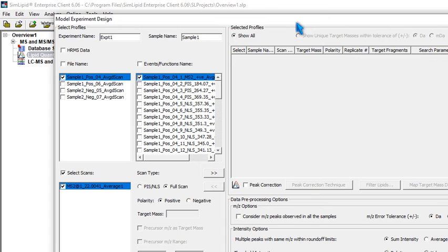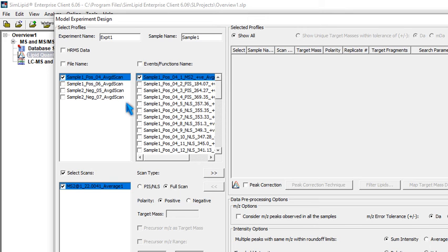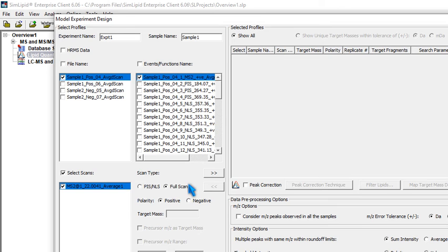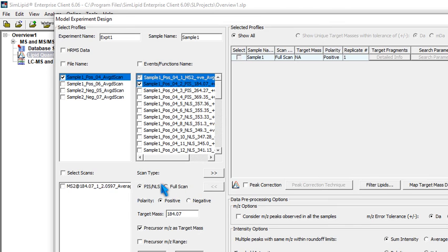Here you can design your own model experiments. One or more samples can be enlisted for the design. The scan information will be automatically visible upon selecting the scans. You can edit to switch between full scan and precursor ion or neutral loss scan types.